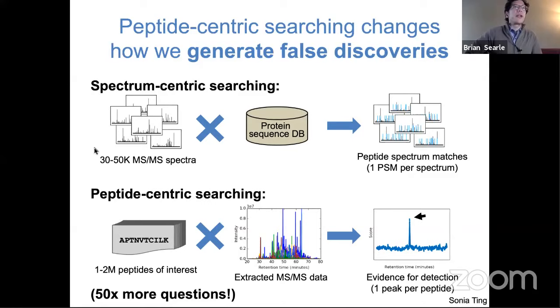And so if you're interested in defining a proteome for a specific type of tissue or something like that, there is an advantage to using DDA for some of these types of exploratory questions, where all you care about is what are the possible peptides that are present in a sample. If you're interested in doing a quantitative experiment, though, I would argue that DIA would be a better measurement. But if you're just interested in detection and just having a long laundry list of all the things that are possibly present, then that would be a good way to go. DDA would be a good way to go.